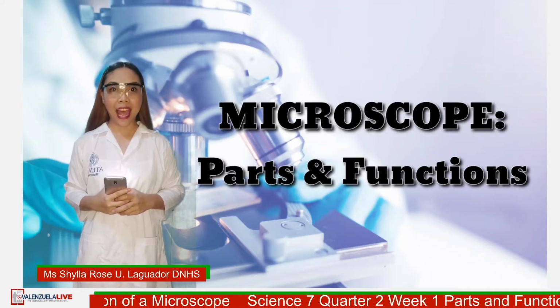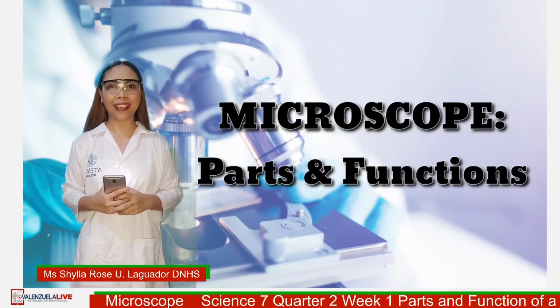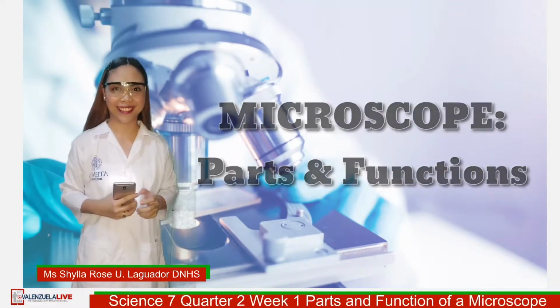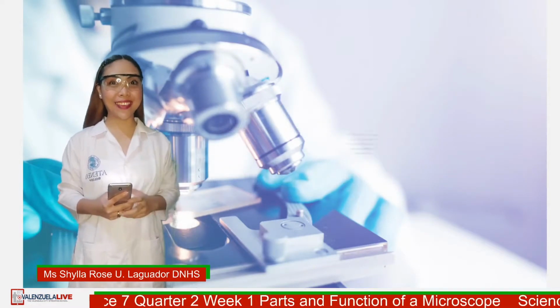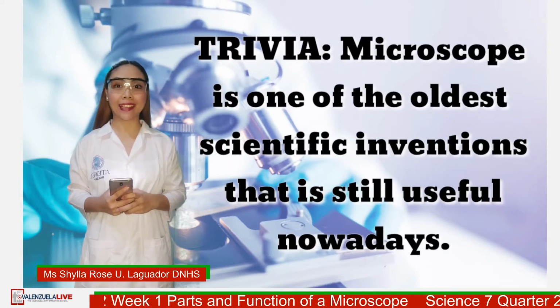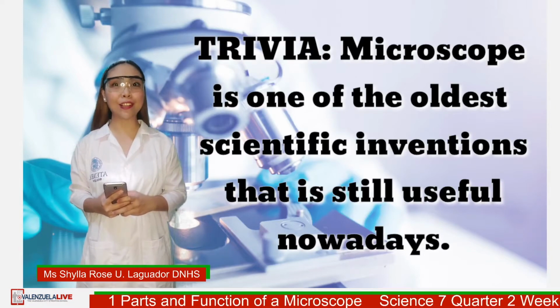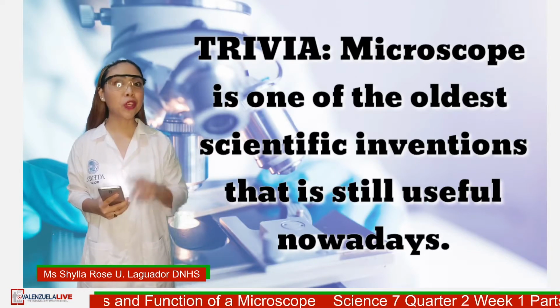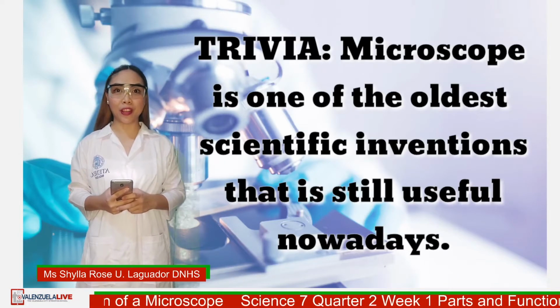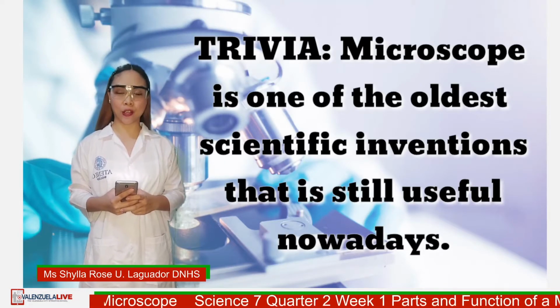As we begin, allow me to walk you through the historical times. Let us have a quick Science Throwback Thursday. It's trivia time! Did you know that a microscope is one of the oldest scientific inventions that is still useful nowadays? You heard it right. The discovery of microscope was coined way back in the late 16th century.